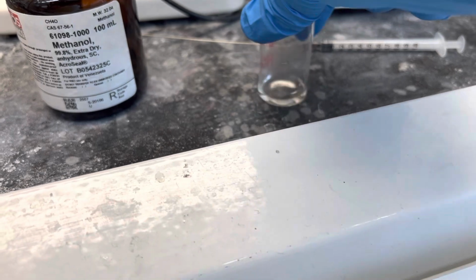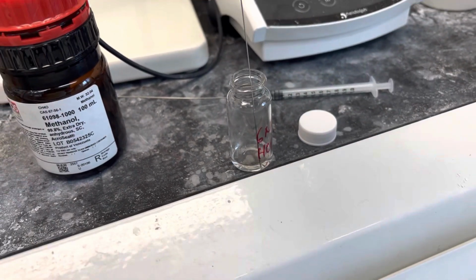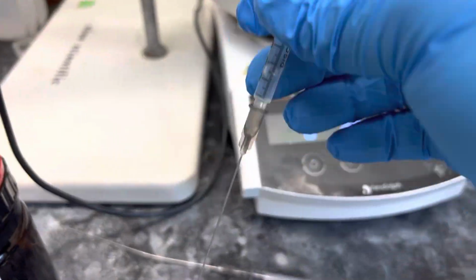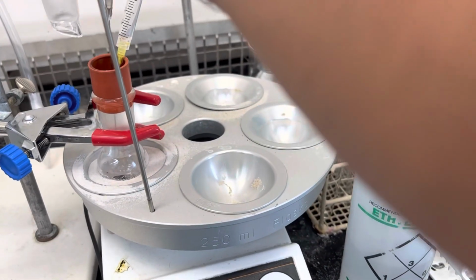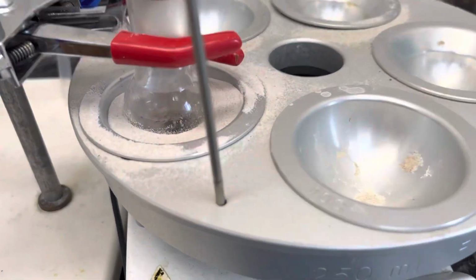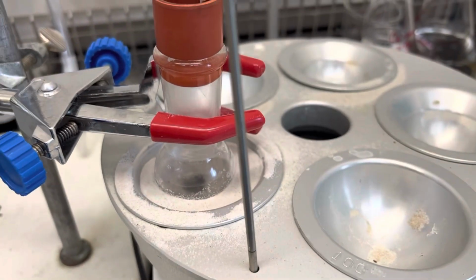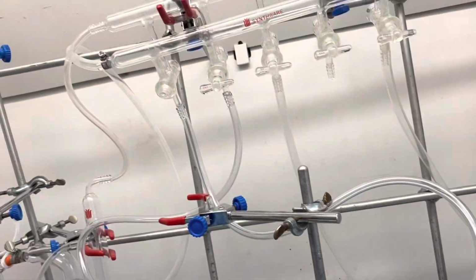Now I'm using the 6 normal HCl here. Here I'm showing the 6 normal HCl I prepared beforehand, before setting up the reaction. I'm taking around 0.5 ml of this 6 normal HCl, and my solvent is 1 milliliter methanol for about 30 milligram of the reaction setup. So you can scale up according to this value. Here everything is done.